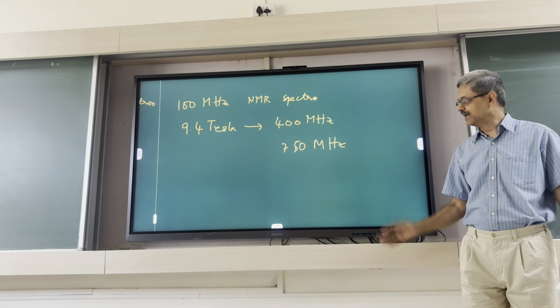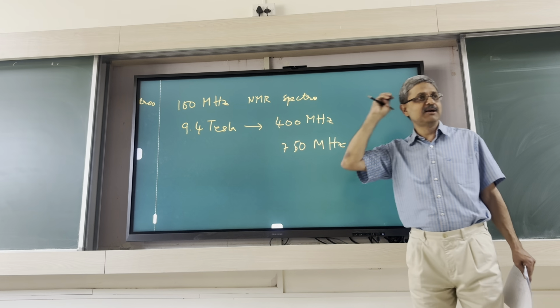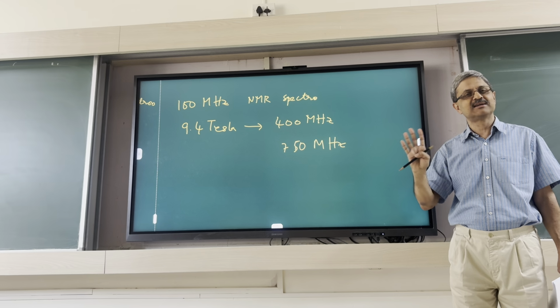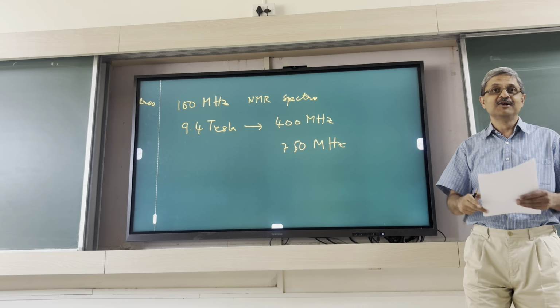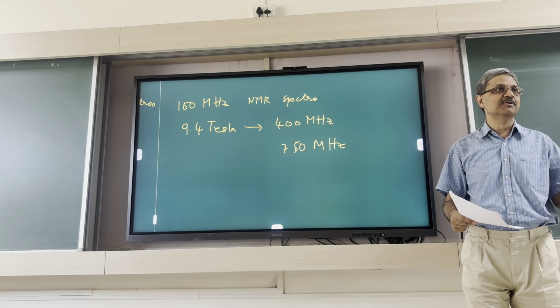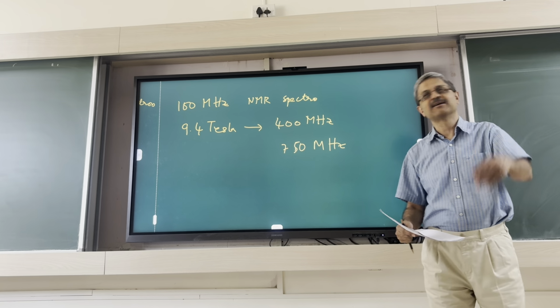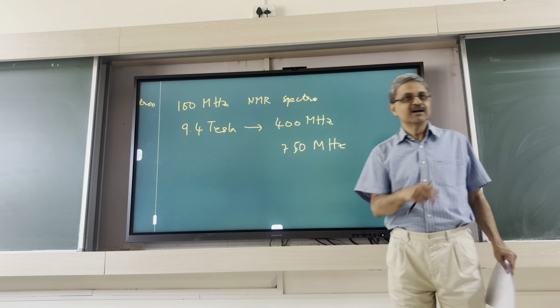Okay, so anyway, so worldwide, what is the highest? Yeah, they have gigahertz, so 1000 megahertz also. But remember, there's a challenge for engineering also. You have to have high field persistent magnets. 750, you check? Yeah, good, thank you.